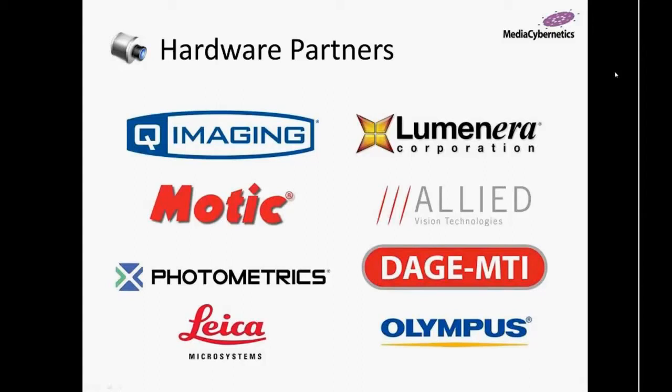With this brand new platform, we've worked very hard to ensure that we continue to support many of our hardware partners. In ImagePro products, for years we've been supporting Qimaging cameras and Luminera cameras. We've had a large number of supported cameras that were written through our software development kits, and we've partnered with a number of companies to continue that support for our latest versions.